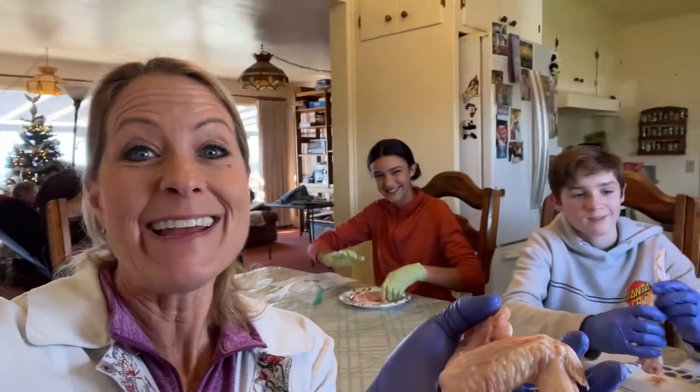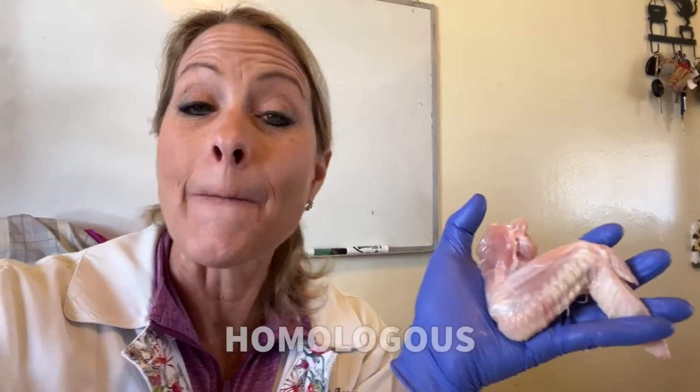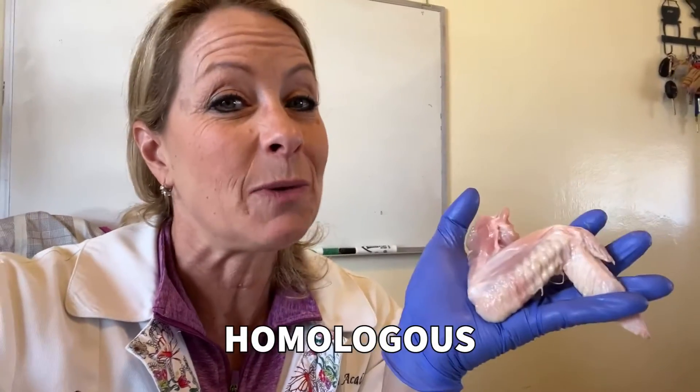Hey science lovers, it's Becky with LabRide Academy, and I am with my life science students today. We are dissecting the chicken wing so that we can learn about what structures are homologous to the human body parts. Homologous means similar to or the same as our body parts in our arm.